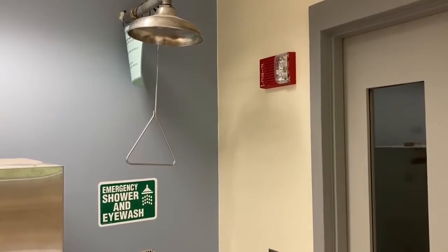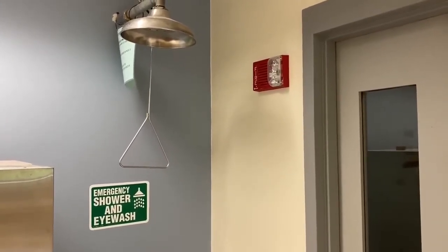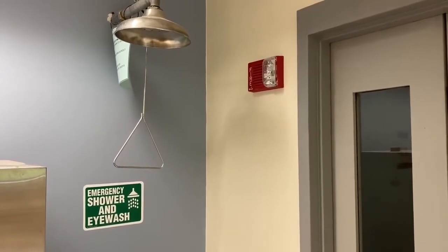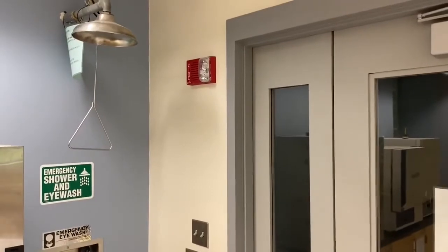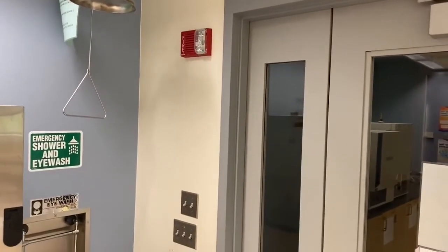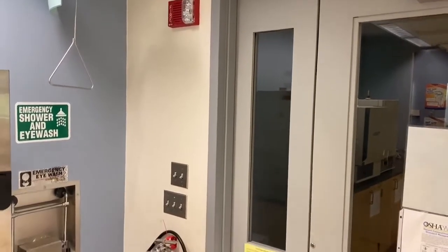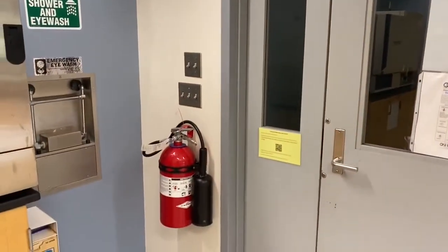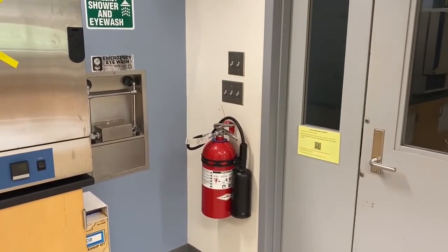Another reason you might want to use a safety shower is if for some reason your hair or your clothes caught fire. You could go over and douse the fire out under the safety shower. There's a safety shower at each of the 2 exits to the laboratory. Always remember that the important safety equipment is located at the exits. Fire extinguishers are also located at the exits, as is an additional eye wash built into the wall.